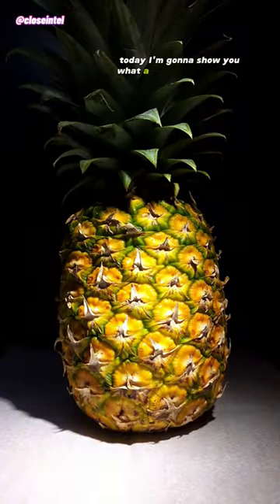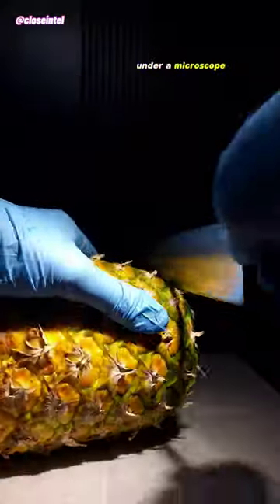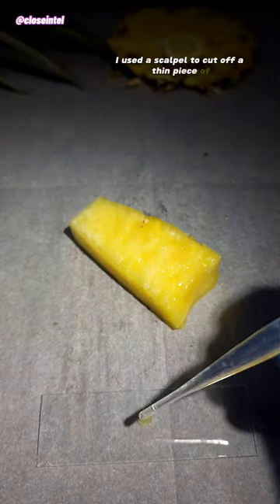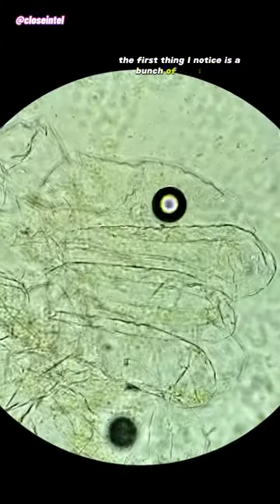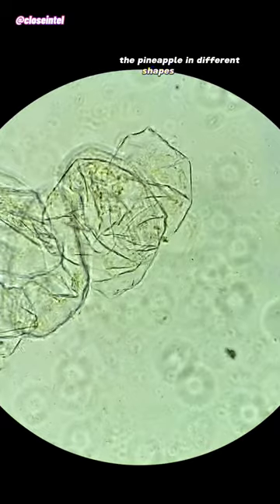Today I'm going to show you what a pineapple looks like under a microscope. After cutting it up into small chunks, I used a scalpel to cut off a thin piece of the pineapple and put it onto a slide. The first thing I notice is a bunch of cells from the pineapple in different shapes and sizes.